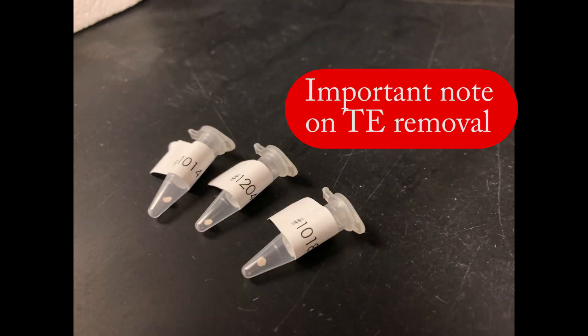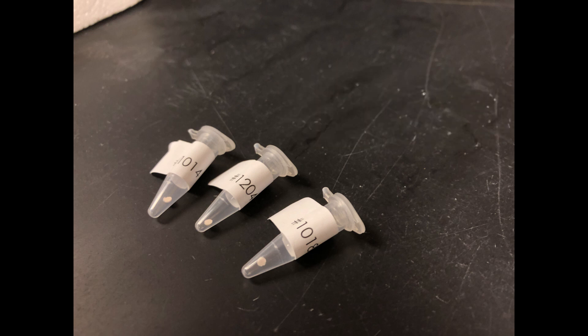The TE step is necessary to wash off the chemical that Whatman has placed on the filter. It is this chemical that facilitates the lysis of the bacterial clones and allows the DNA to stick. Failure to do the TE step will inhibit the transformation.